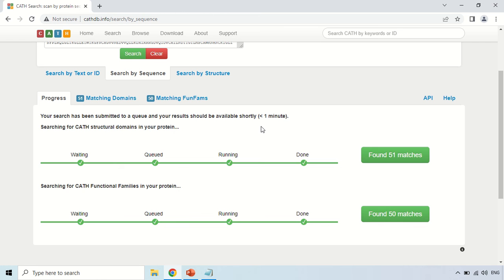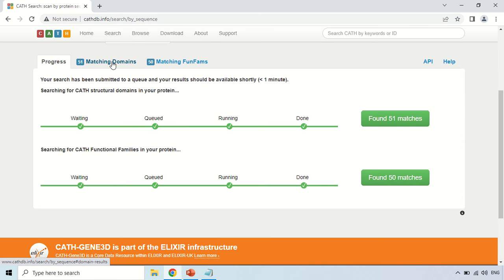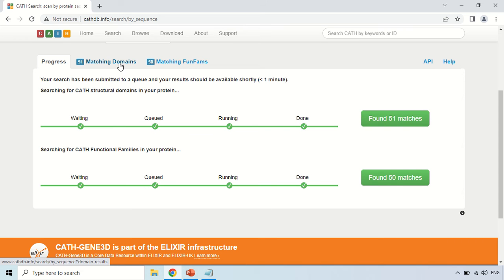This software matches your given sequence against other known protein domains and similar domains. If the domains are similar, it means your protein will likely work similarly to the matched protein. Now the results are done. In this section you can see 'Matching Domains' and 'Matching Functional Families' (FunFams). The matching domains section shows structural matches — it found 51 matches — while the matching FunFams section found 50 matches. I will first click on the structural domain section.